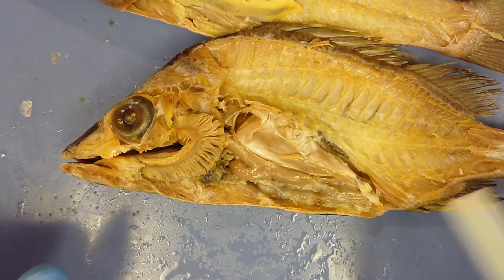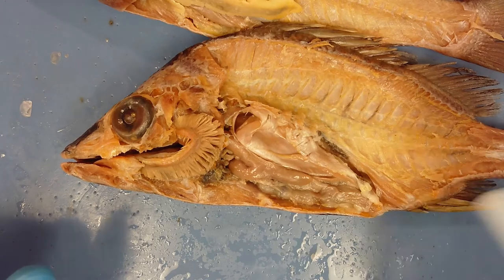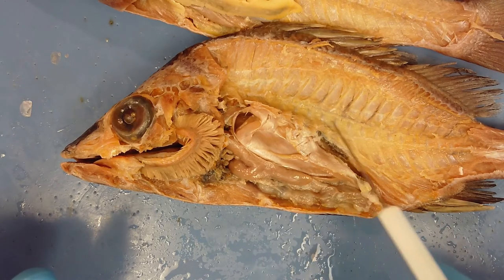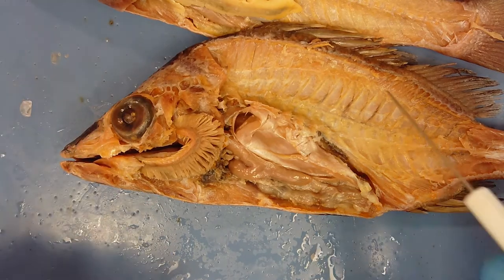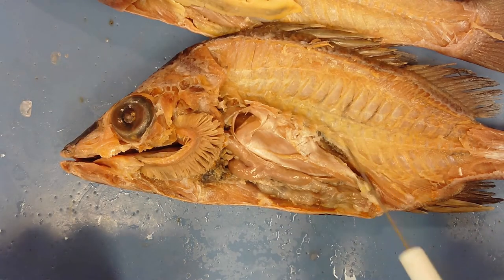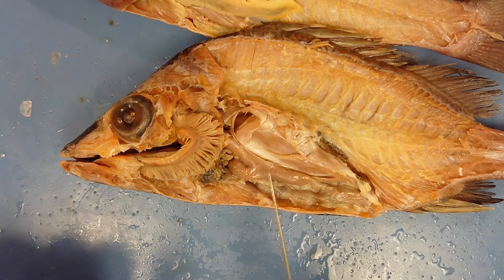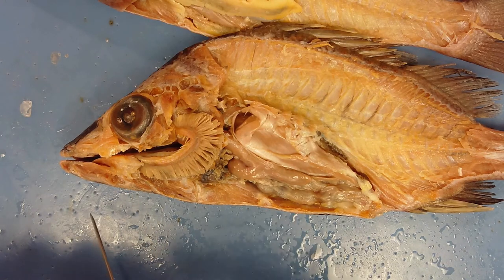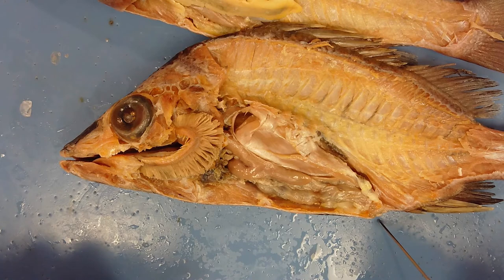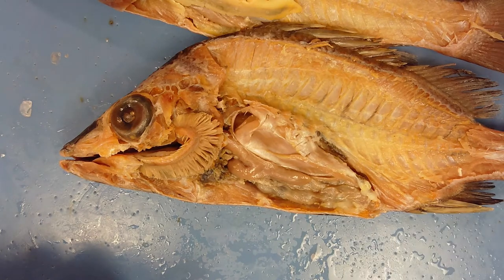To recap: the fish has epaxial muscle and hypaxial muscle connected to the vertebral column, with segmented myomeres in the swimming muscle. Internal organs include the swim bladder, stomach, intestine, heart, gills, tongue, eye, mouth, anus, ureter, and kidneys.